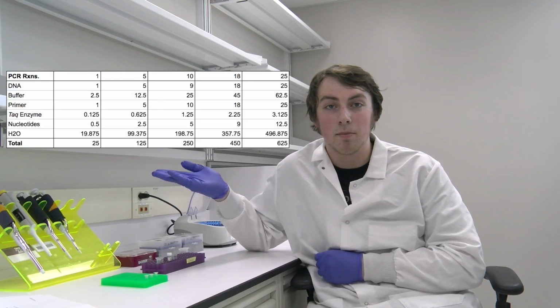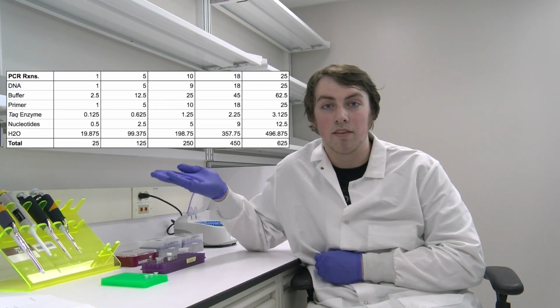later on. If you're adjusting to 25 microliters, you can use this table, which will show you exactly how much of each material you need per given amount of reaction. Just remember to always make enough solution for 2 extra reactions. One of these reactions will be for your control, or the reaction that has no DNA in it. The extra 25 microliters is just to ensure that you have enough solution in case you make a mistake.